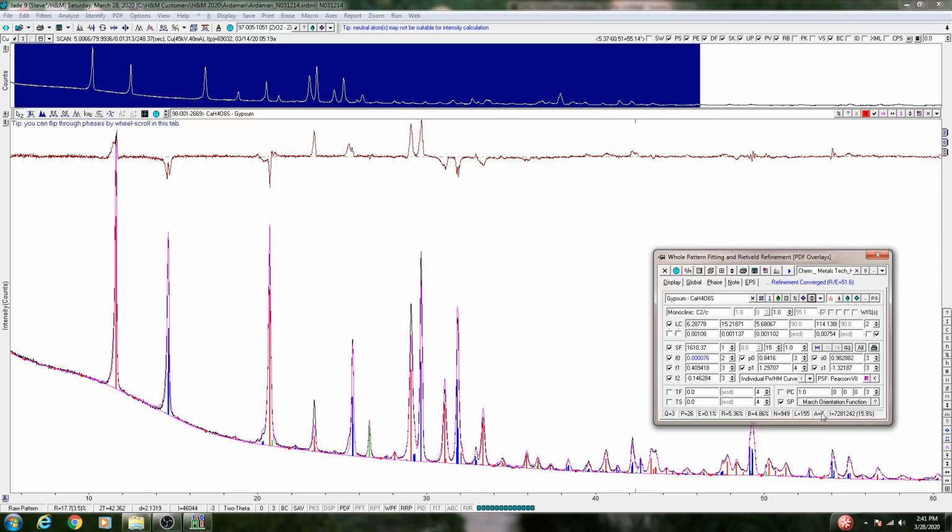So down here is a button that says PC. That's preferred orientation correction. We're going to check that box, okay? And it's going to default to a pull direction. All right, notice the minute I checked this box, it dropped in 021.